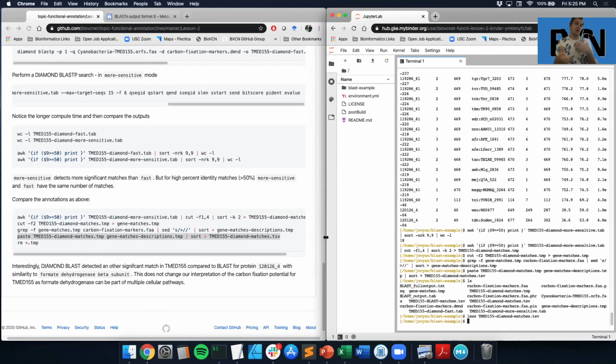The other thing is to consider all the context that we have that goes into this. So we said at the beginning that we were fairly confident that this is a cyanobacteria. And we notice, and for those of us who work in the ocean, we notice cyanobacteria, or in lakes, that cyanobacteria are fixing carbon using the Calvin cycle, so we'd expect to see Rubisco. So if I had this MAG, which was incomplete, 64%, and I only hit the small Rubisco subunit, I would use that as an indicator to think, okay, maybe I've successfully found that this particular cyanobacteria has the functionality that we believe of carbon fixation.